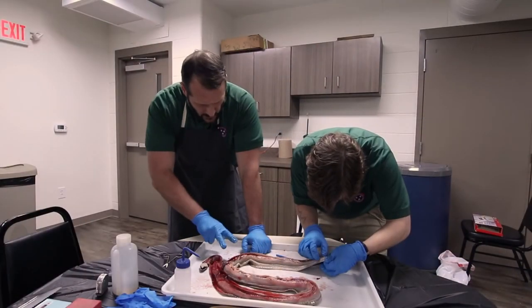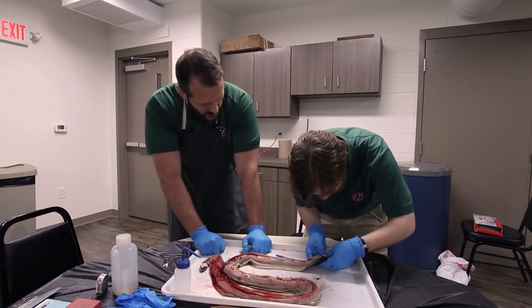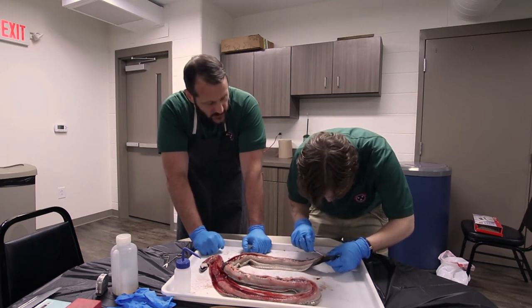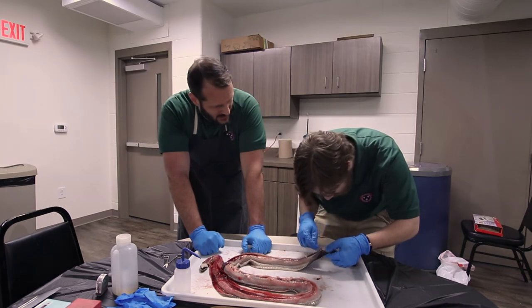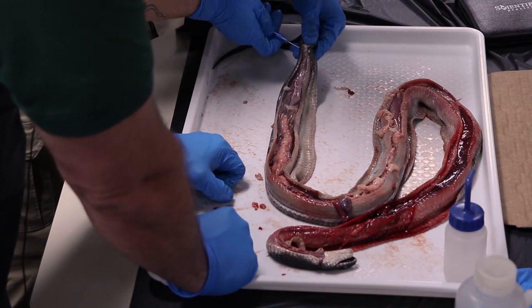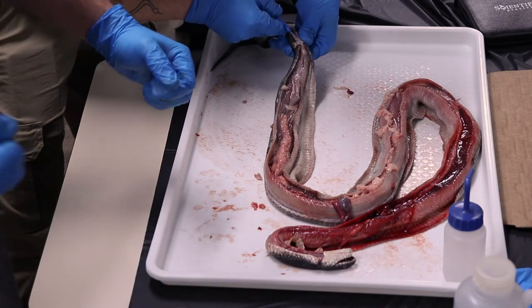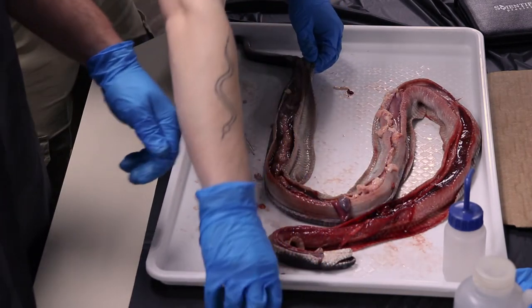Yeah, the hemipenes are a paired structure, right? Just on the inside of the cloaca. And even though they're not readily visible when the snake is just out slithering around, they usually don't hide if you're actually in there, right? So the fact that nothing's jumping out on us makes me think that your initial assessment was correct. This was probably a female. Let's see, I'm gonna take these scissors.